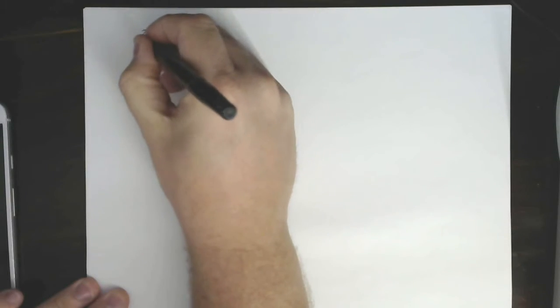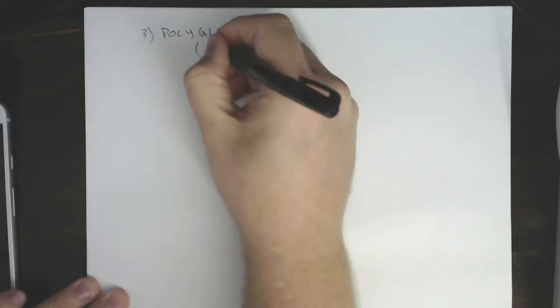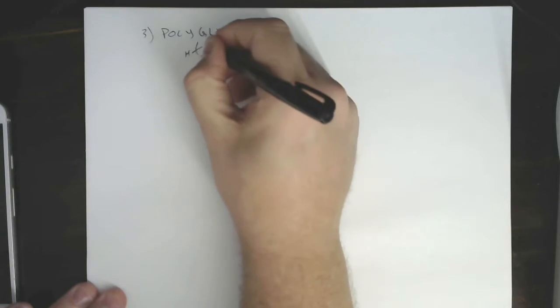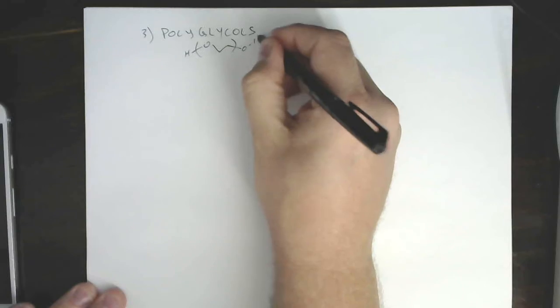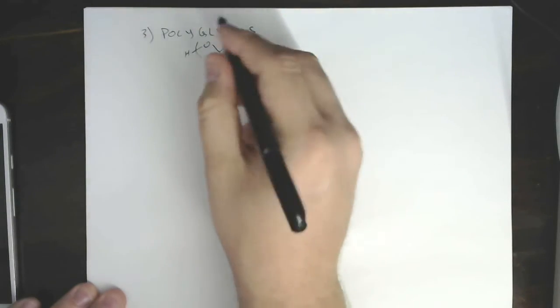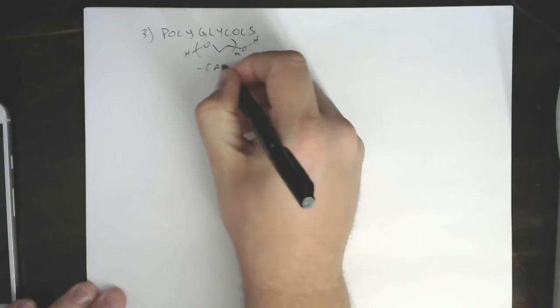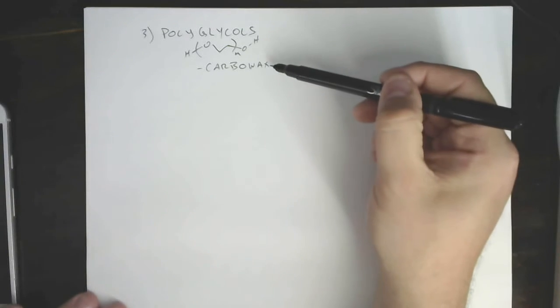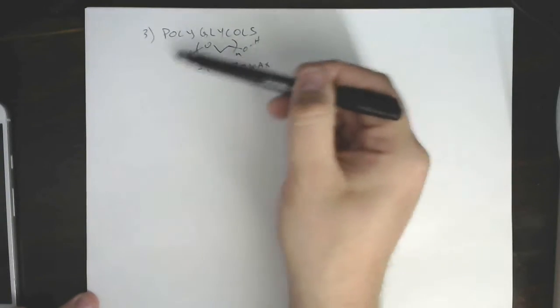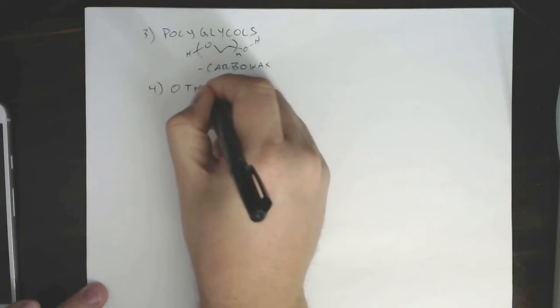There's another really common class of stationary phase materials in GC. These are polyglycols, mostly polyethylene glycol. So predominantly we're talking about this right here. Sorry guys, not a polymer scientist here, to kind of keep looking back at where we put these brackets. Yeah, I think that's right, polyethylene glycol. And these go by the commercial trade name Carbowax, and I'm sure there are 1,000 other trade names based on this material, and the different Carbowax materials are essentially just based on the different sizes of these polymer chains.